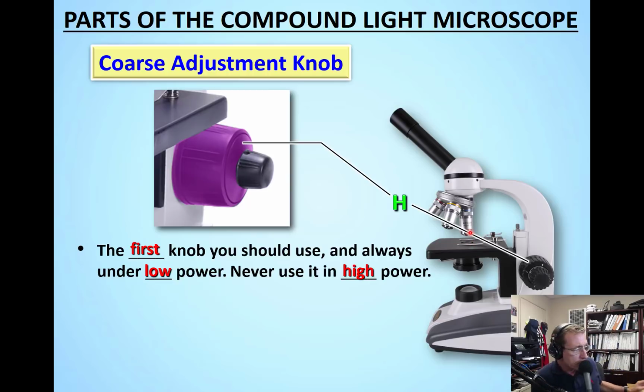And even on ours, I noticed, if we have this high powered one on, if you look in there, you can see the space. If you imagine that there was a slide there and I move this up, see how that's actually going to smash the slide into the lens? That's not good. That's going to be bad.